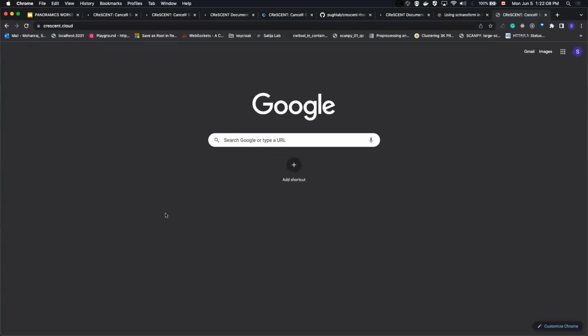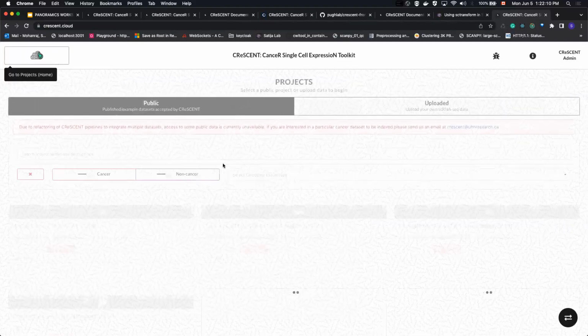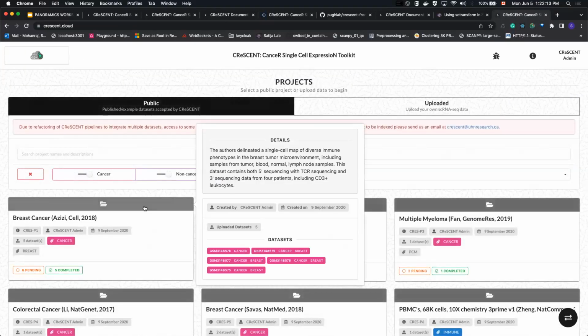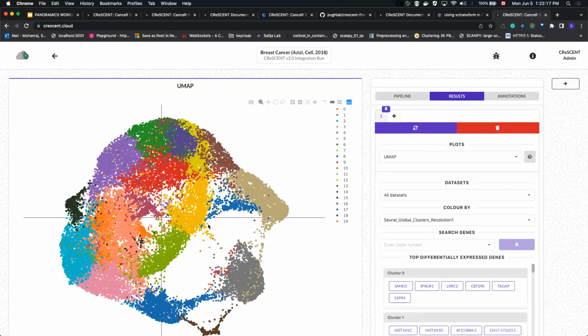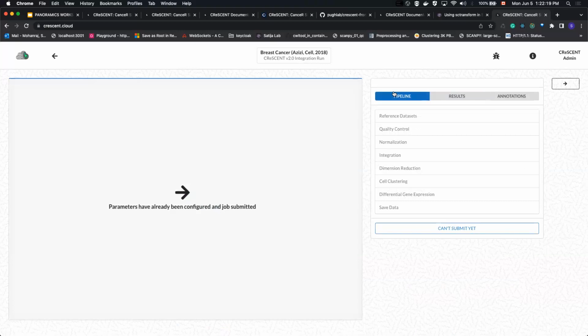As you enter the app itself, it should only be 2 clicks to get to some sort of meaningful visualization. Getting your data to run should be a simple upload, and then setting a few parameters if you choose, but you don't always need to set the parameters.